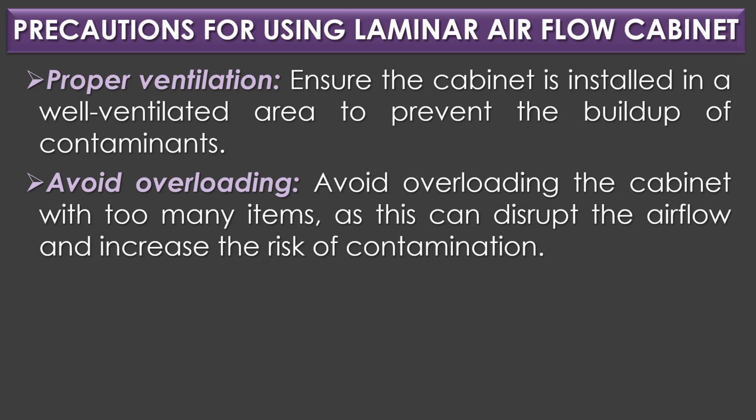Finally, avoid overloading. Avoid overloading the cabinet with too many items, as this can disturb the airflow and increase the risk of contamination.